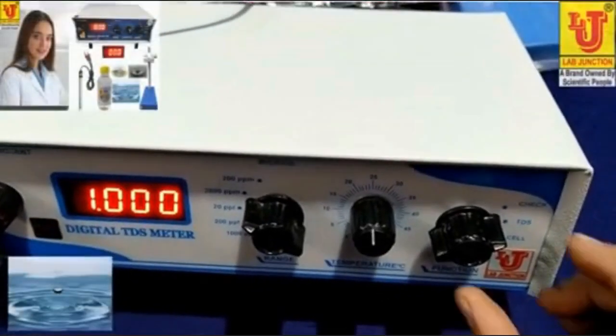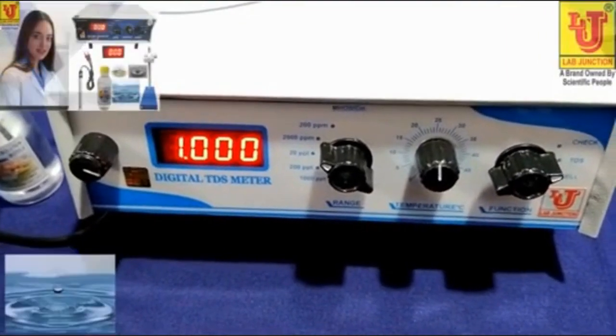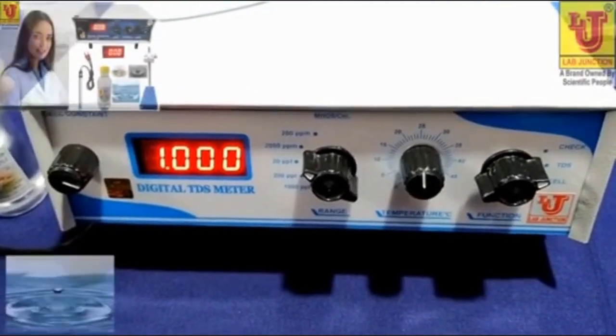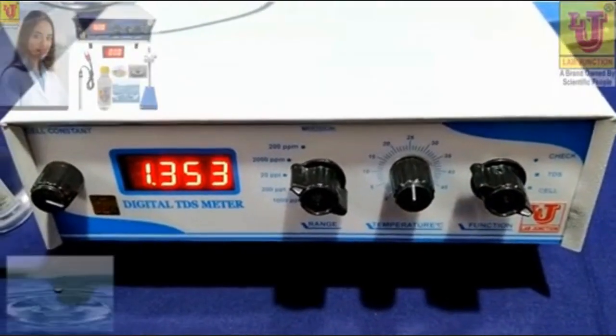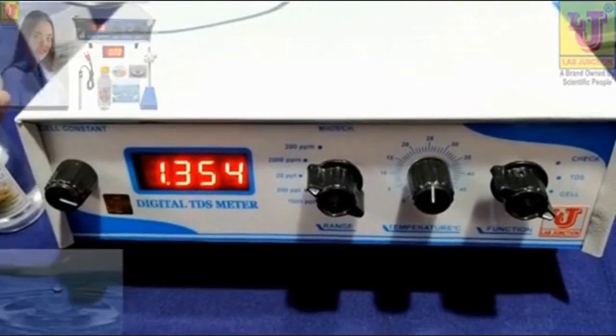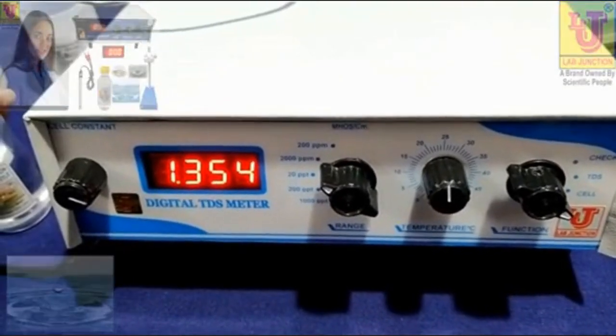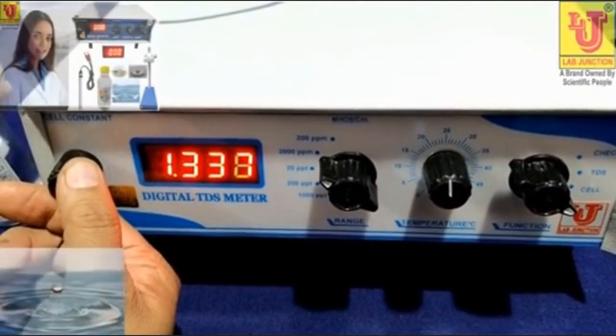Then you go directly and you don't have standard solution. You want to calibrate without standard solution, then directly go to cell constant knob. Then feed your standard value. Suppose your standard value is 1.352. Then set from this 1352.